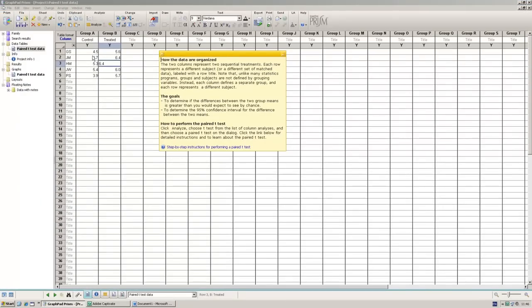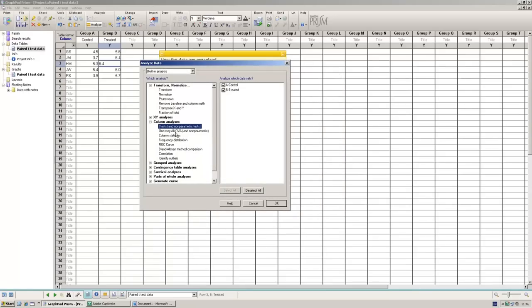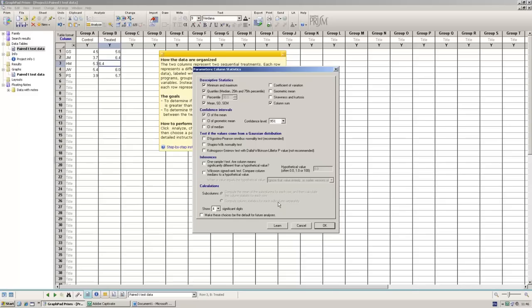In terms of the functionality and the things we can do, the main button that we want on this top toolbar is the Analyze button. Okay, with our Analyze button, if we click this is where we get the access, funnily enough, to all the analysis. The first one we're going to try is column statistics. Now, column statistics is where we access our descriptive statistics. Some of these are ticked for default already. Some of these more complicated ones are not. Okay, I'm not going to change any of these apart from this one here.